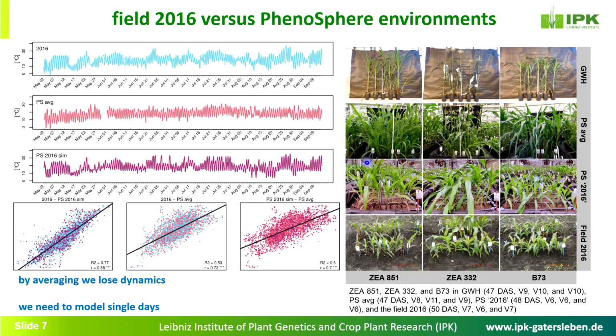And in the greenhouse, plants are much, much larger and have a slender stature. They didn't invest into their stem, so we have to fixate them, otherwise they would fall over. With the input of wind movement, the plants become much more sturdy already in the averaged climate, but they are larger. And running the simulation of the single season, we are pretty close now to field phenotypes.